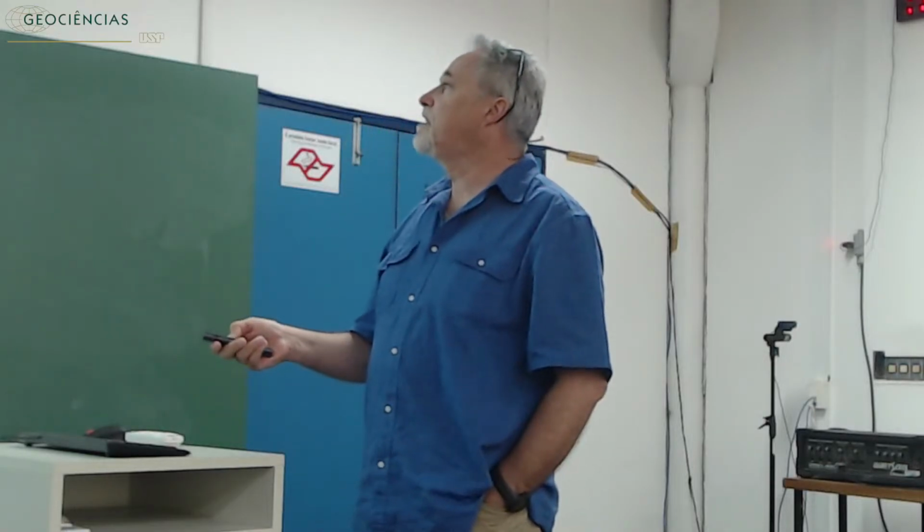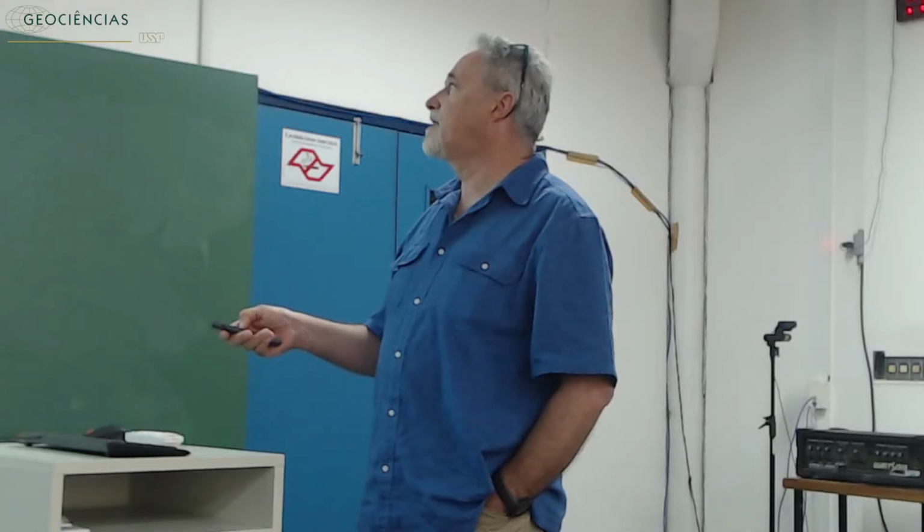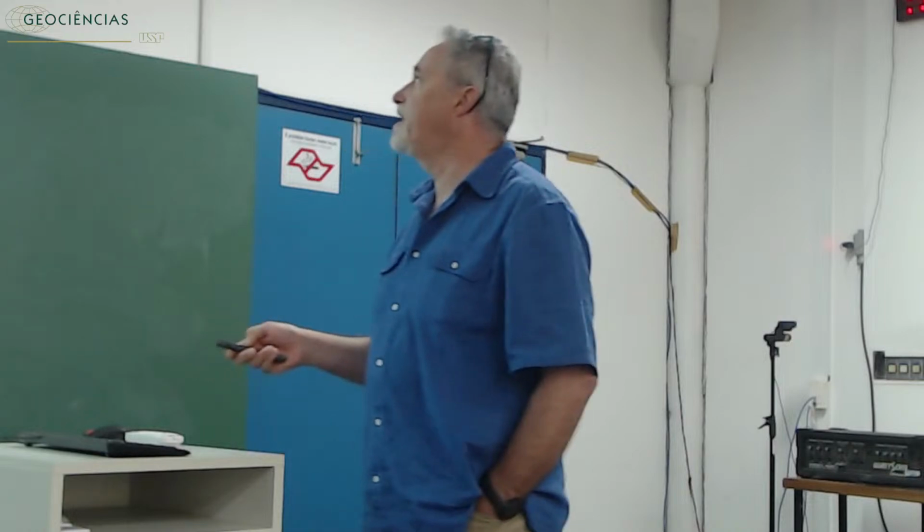Iron instead oxidizes a lot. The blue one is the pristine material, the red one is the charged material. We can see there is both a considerable shift in the edge and also in the pre-edge peak. We can calculate exactly the redox ratio between trivalent and divalent iron.